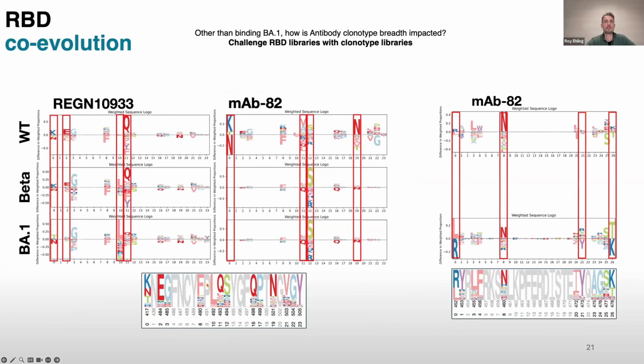And of course, there's always a lot of noise and bystander mutations in combinatorial mutagenesis, but if you plot the relative frequency of the amino acids in each position of the RBD present either in the binding or in the escape fraction, you can hope to find positions that might be key to the escape in this newly affinity matured or evolved clonotype pool.